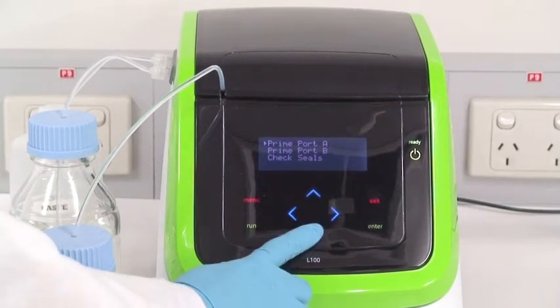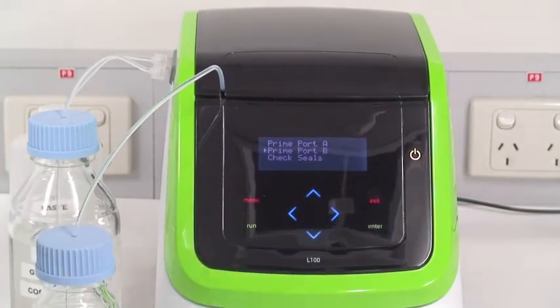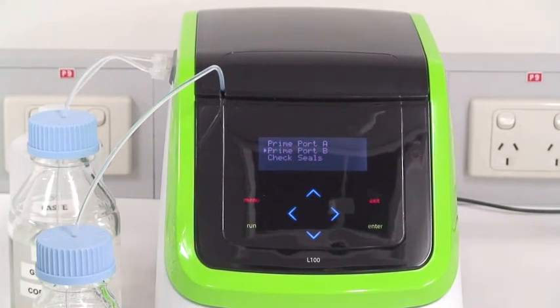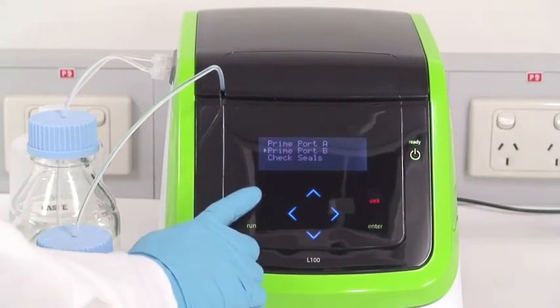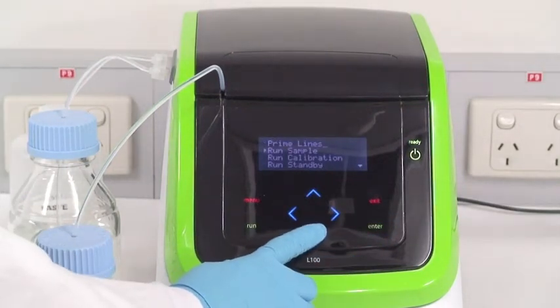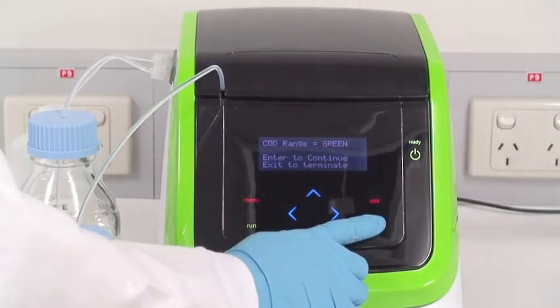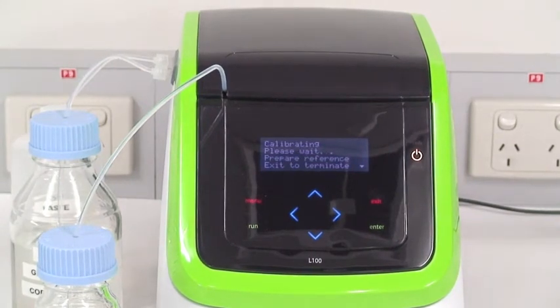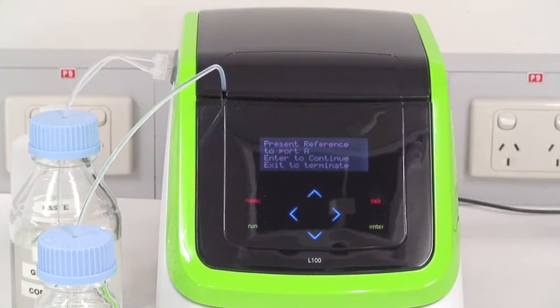Now repeat for port B. When both lines are primed, select Run Calibration. Midway through the calibration, the L100 will prompt you to confirm that the reference solution is present. Press Enter to continue.